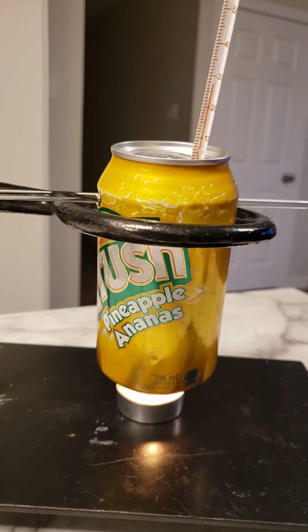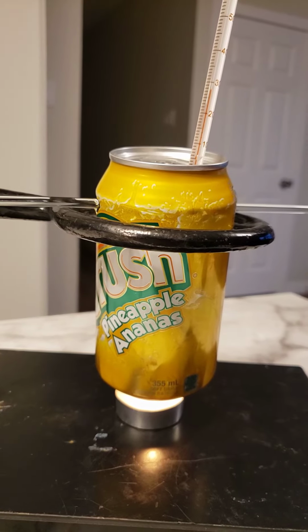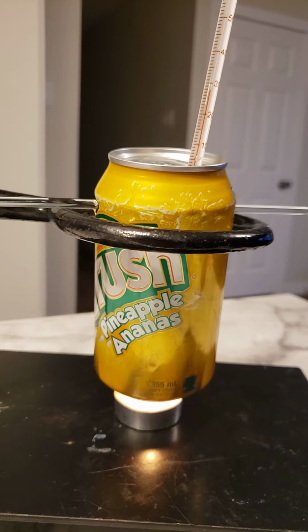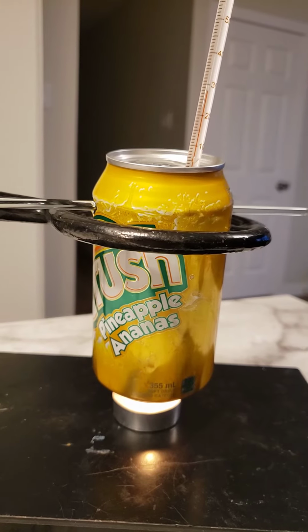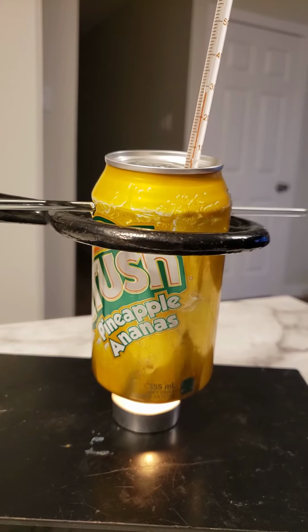So this is how the experiment works, and I'm just going to let the temperature rise till it gets to roughly 10 or 11 degrees Celsius more. Blow out the candle, put it back onto the balance, get the final mass, which will be lower than the starting mass or initial mass, given the fact that candle wax will have been burned and used up.